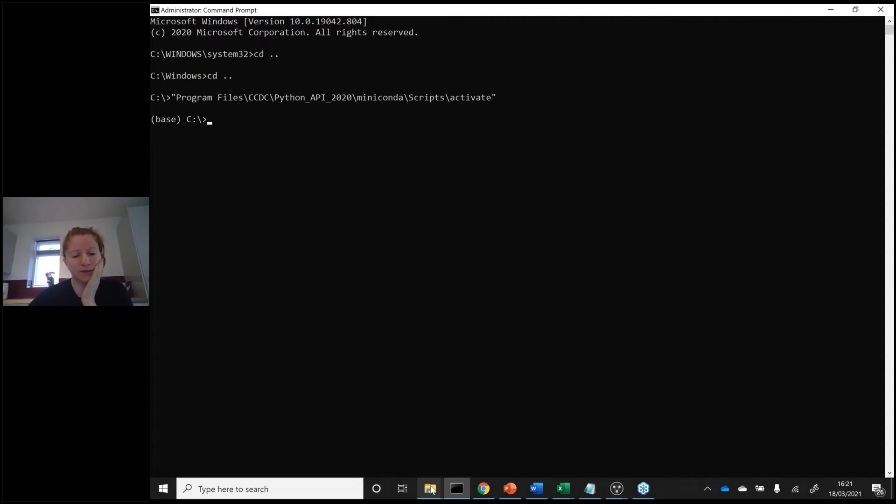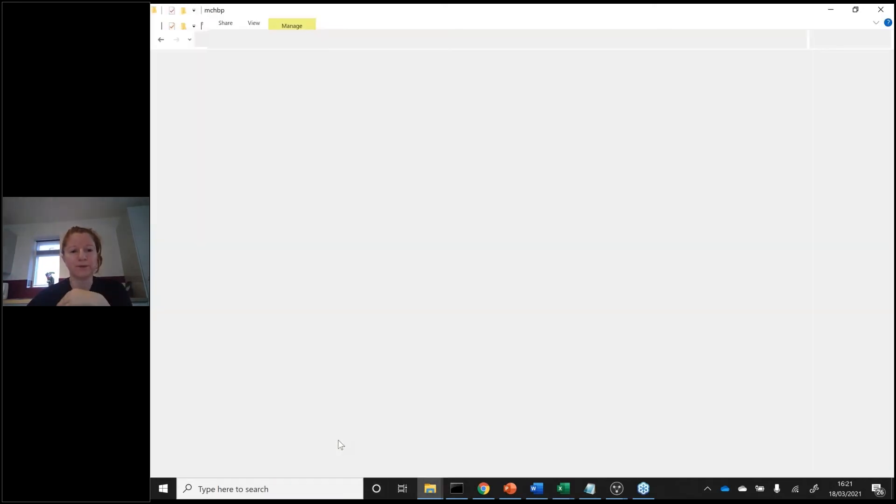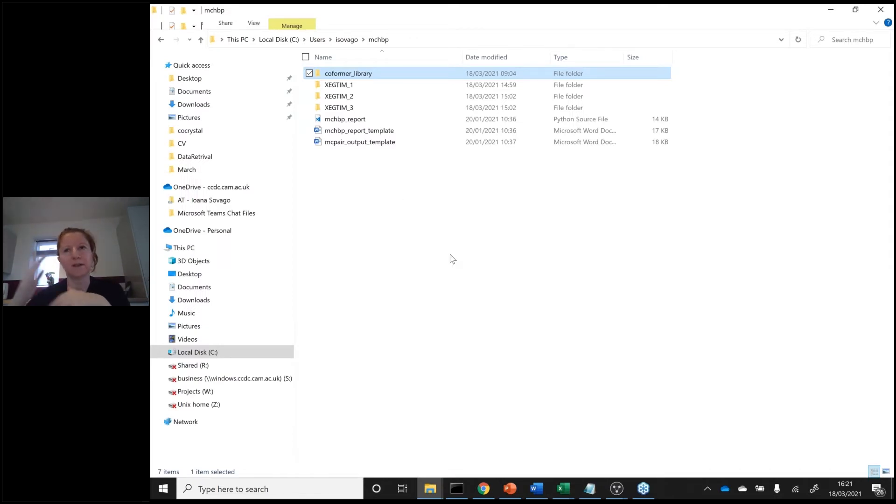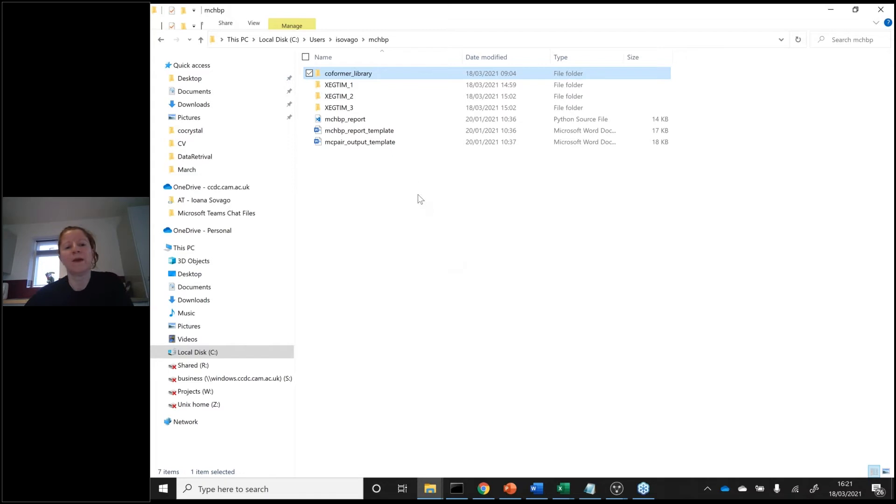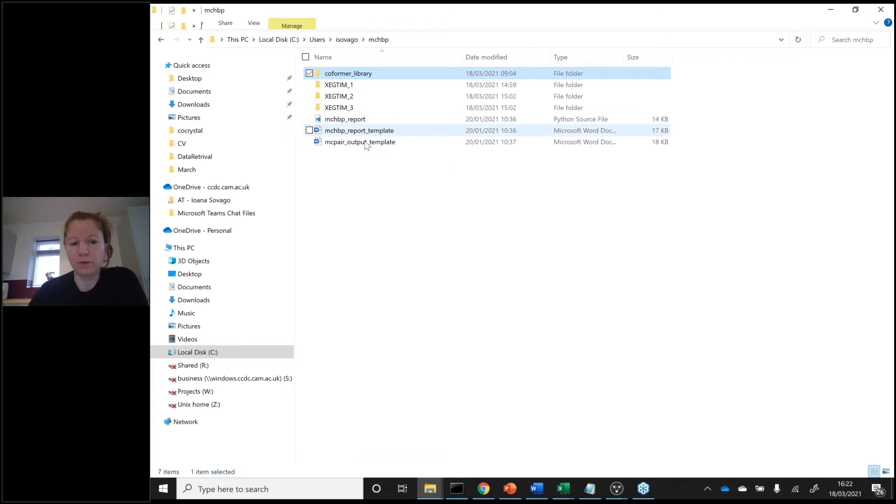To run the script, what you have to do is look at the outcome you've just seen in your tables and then decide which library you want to rank now. We have pre-made ready for you a Python script and two Word document templates.